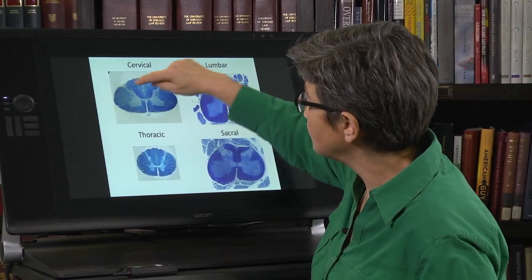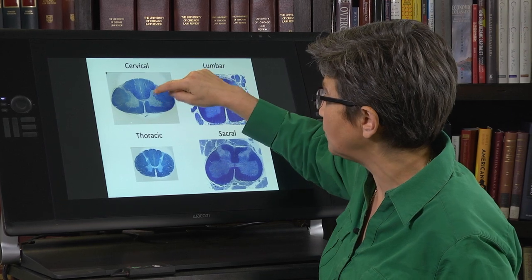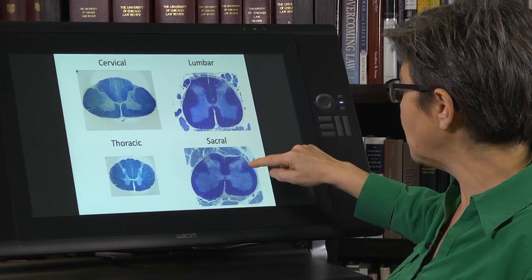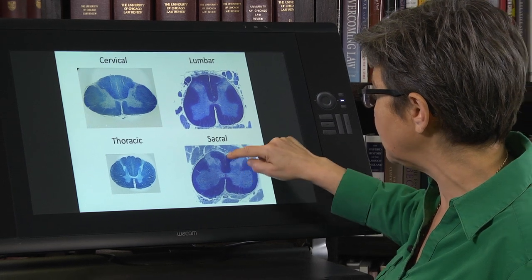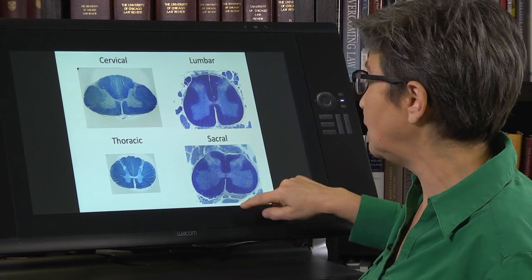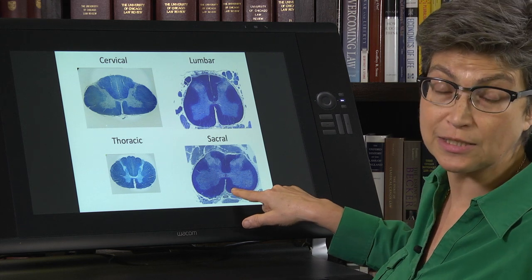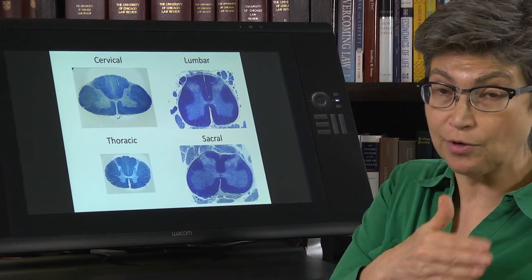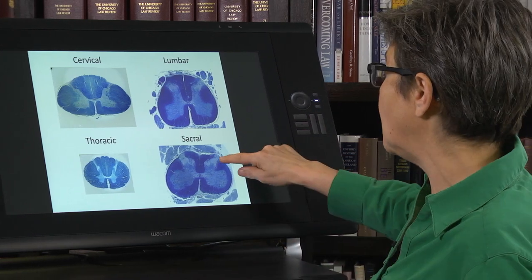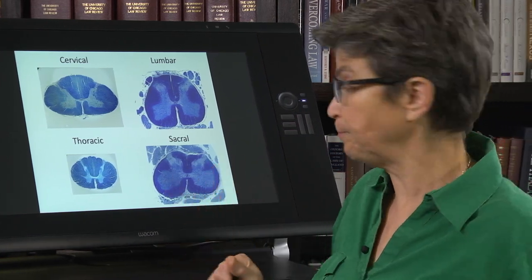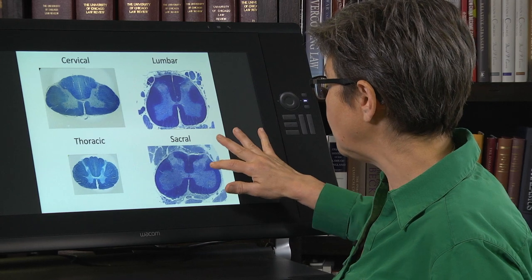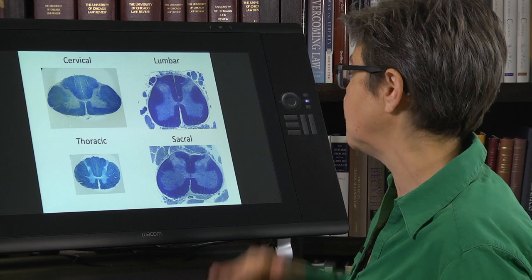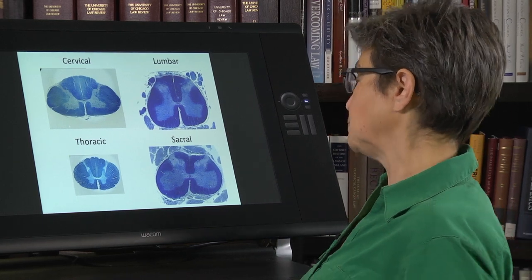Look at all the white matter surrounding the gray matter in the cervical cord. And in comparison, look at the relatively little bit of white matter in sacral cord. And this looks to me as though it's around S1. By the time you get even back to S3 or S4, it's going to be much less even than that. So there's really a reduction in the amount of white matter as you go progressively more caudal through the spinal cord.